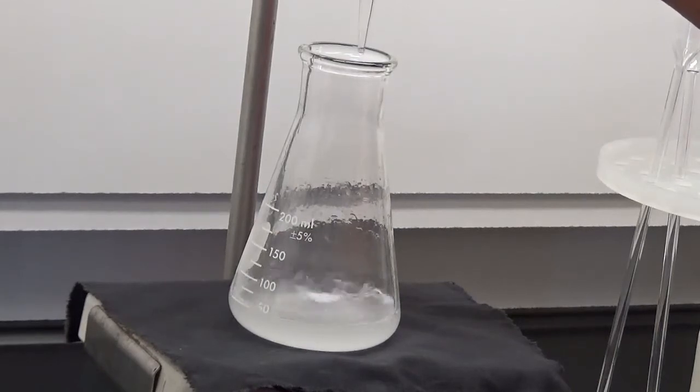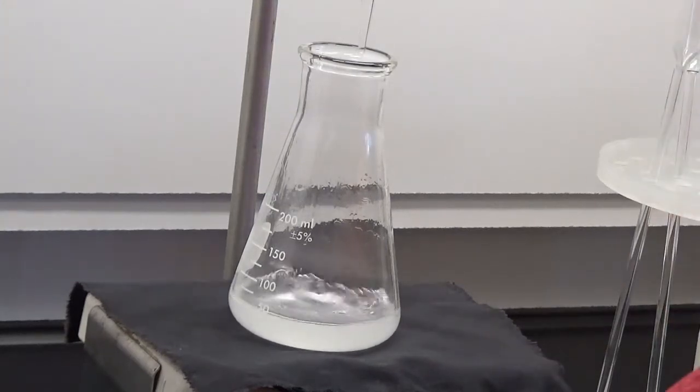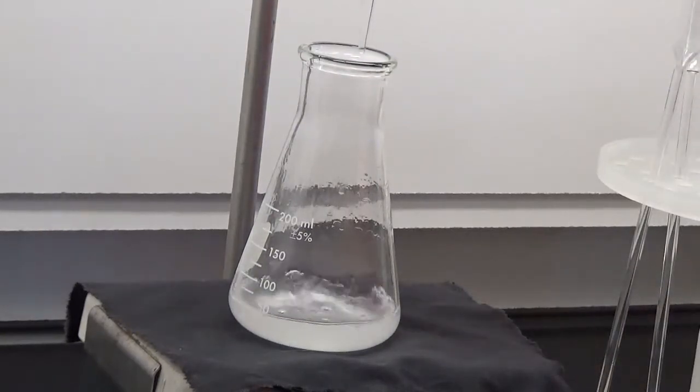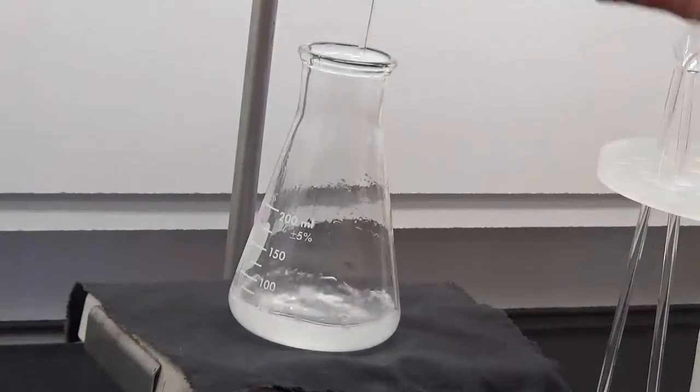So now I'm going really slow. Like almost not going at all. Drop. Drop. Drop. Drop. Drop. Drop. Oh, look at this. It's clearing. Maybe I jumped. Maybe not quite yet, but I think it's really close.